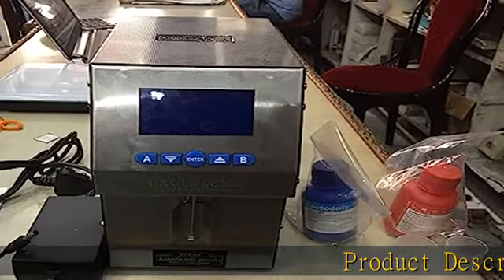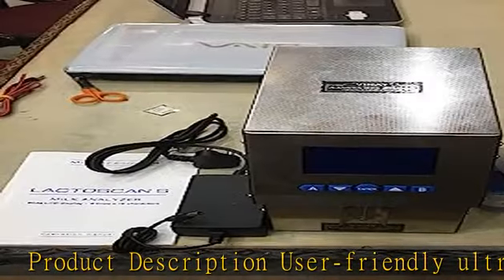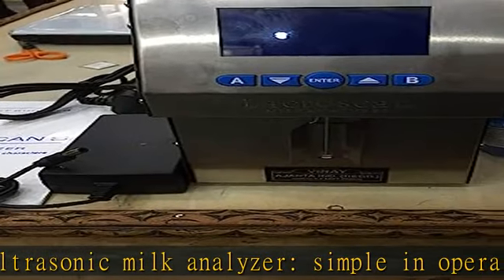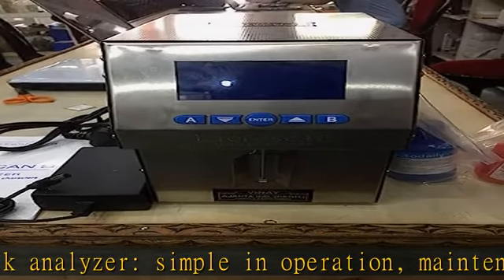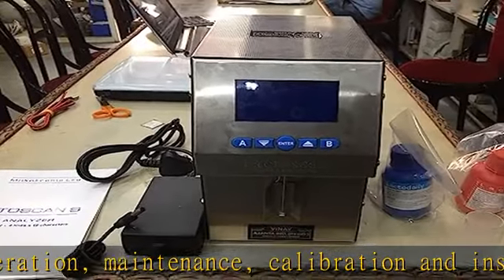Product description: user-friendly ultrasonic milk analyzer, simple in operation, maintenance, calibration, and installation. Cleaning with peristaltic pump. Portable and compact design. Very small quantity of milk required. Low power consumption. No use of hazardous chemicals.